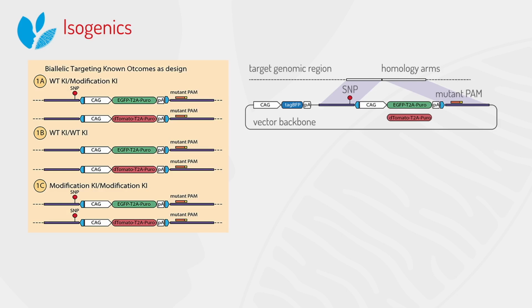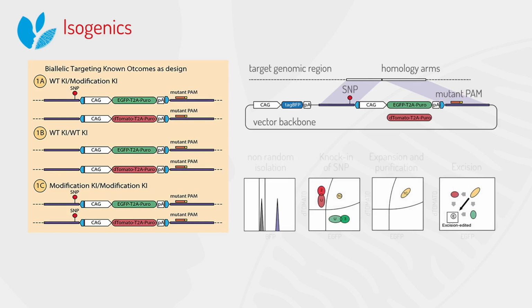In this case, we also include another fluorescent, a blue fluorescence, that allows us to detect when a cell was incorrectly modified. So normally in this process, we first select the cells that were correctly modified by flow cytometry, just by selecting the ones that are not expressing the blue fluorescence, and then afterwards we purify the cells that have both fluorescences expressed at the same time, so the red and the green making a yellow cell.